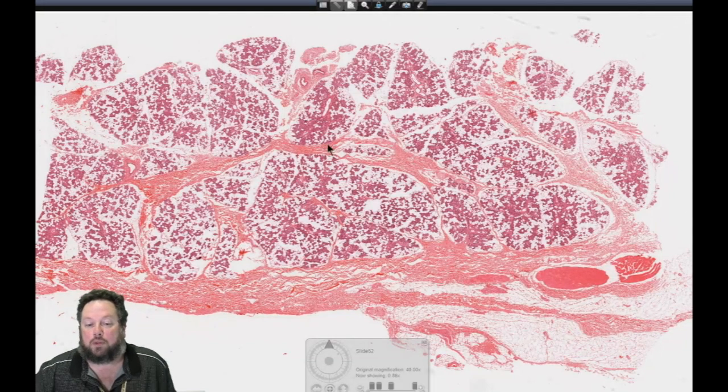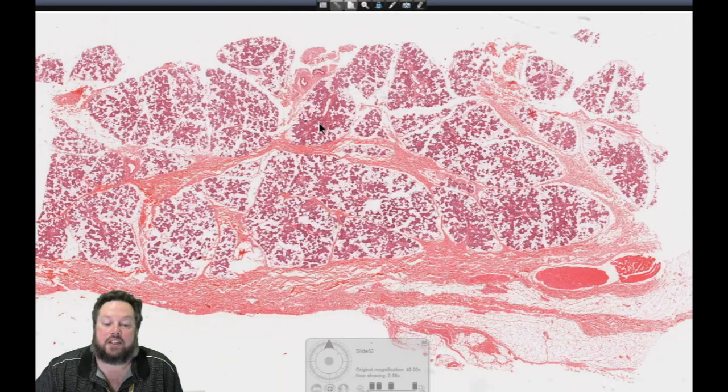So salivary amylase comes from the parotid salivary gland. As I say, it's an entirely serous gland. It has a connective tissue capsule, which you can see on the outside here, dense irregular connective tissue. You can see some blood vessels and things. It has lobes, which are then further subdivided by connective tissue into lobules. Each of these is a connective tissue septum, which originates from this connective tissue capsule here.